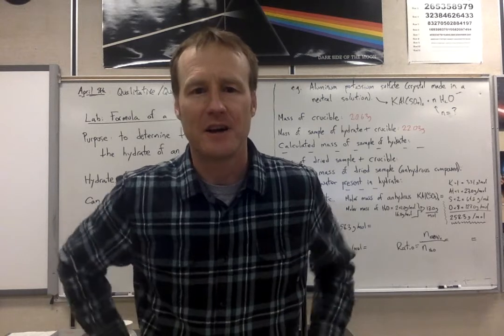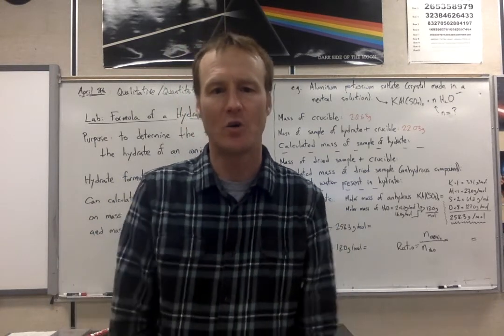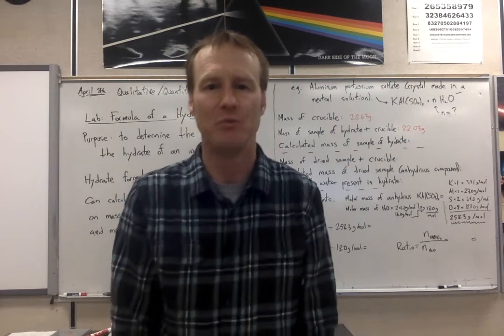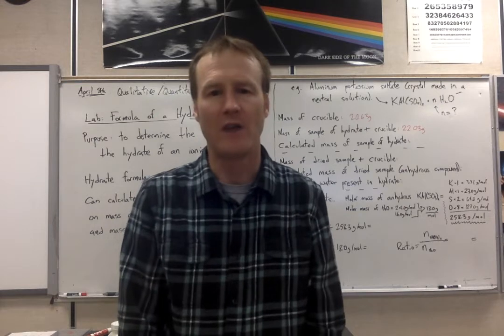So, yeah, I didn't cover much for a little bit, had some other stuff going on, and now I'm going to get going also today with a lab that will be due next week. The title of the lab is the formula of a hydrate.